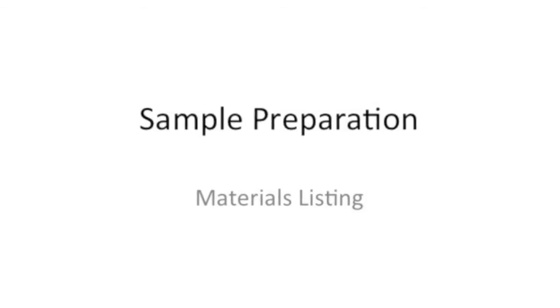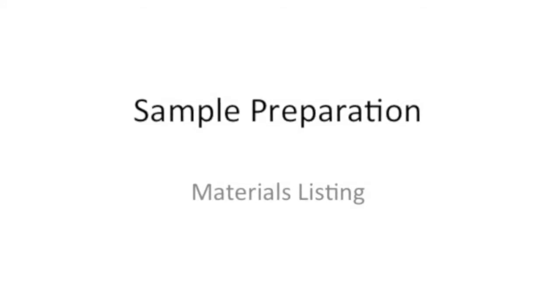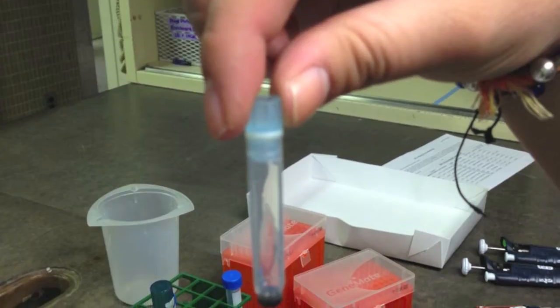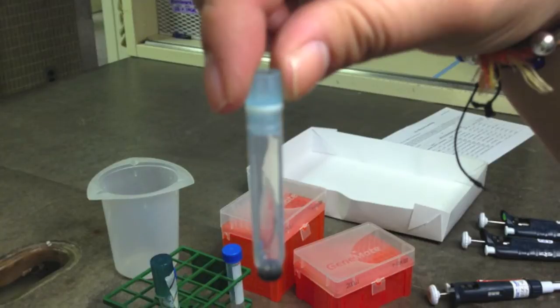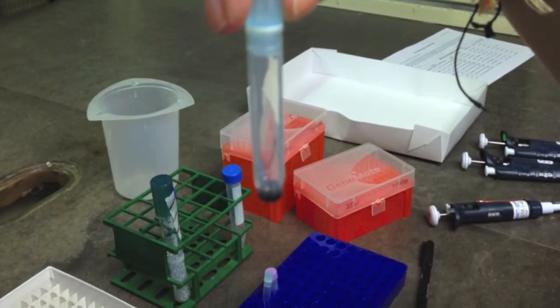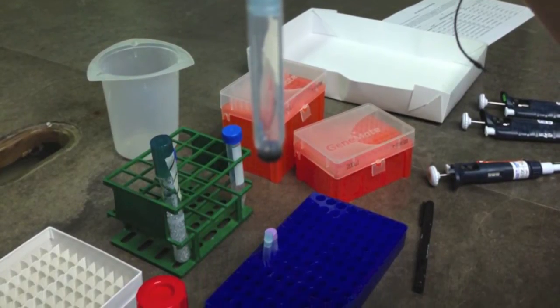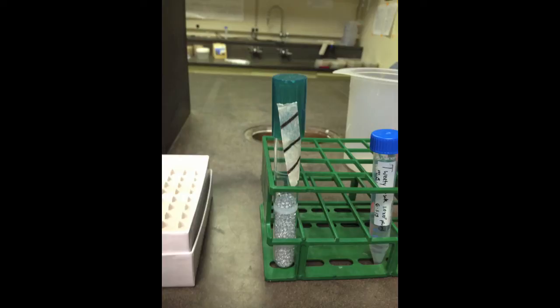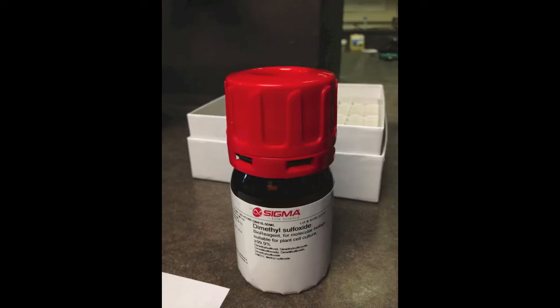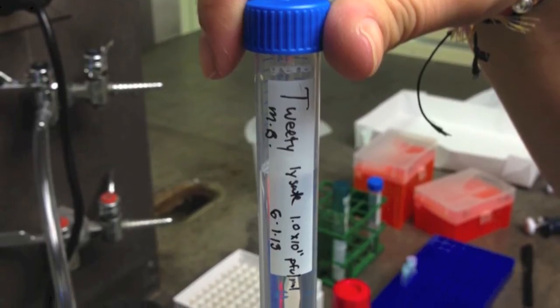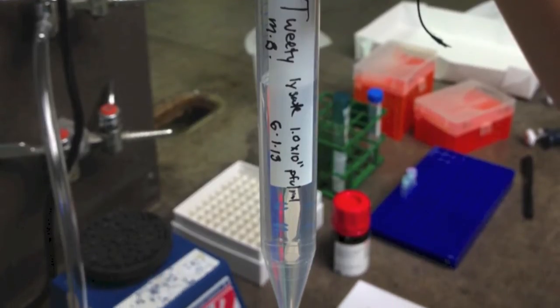Before we talk about the sample preparation process, I would like to mention each of the materials included in your archiving box that you will be using to make sure your samples are properly archived. The first, and perhaps most important, part of the materials you receive from us for archiving purposes are your screw-capped, bar-coded microcentrifuge tubes. Each tube has a unique barcode identifier that will allow us to differentiate the tubes and keep track of them in our inventory. Your package will also contain glass beads which will need to be sterilized, DMSO for use in archiving, a return box for sending us your samples, and finally you will need to provide a high titer lysate of your phages to be archived.